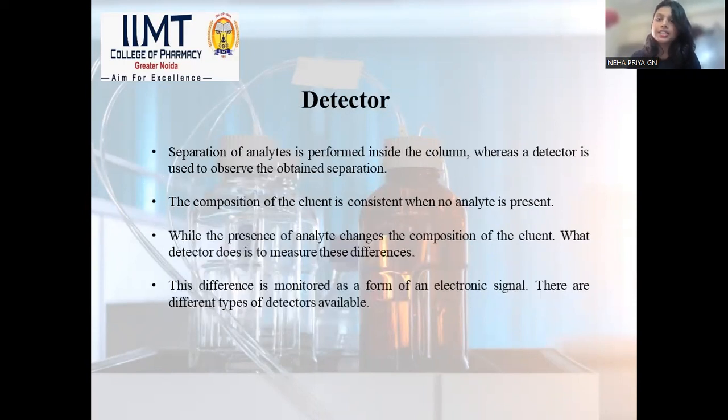The last thing used in the HPLC is detectors. In HPLC, as I have already mentioned, we go for spectroscopy techniques. For example, IR spectroscopy and UV rays are used here as detectors. Mass spectroscopy is also used in HPLC as a detector. The detector will detect the result and give us the result in the form of a graph between absorbance and retention time.